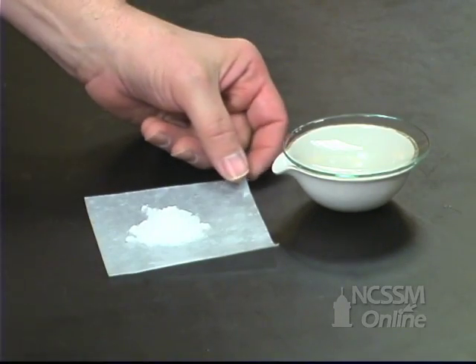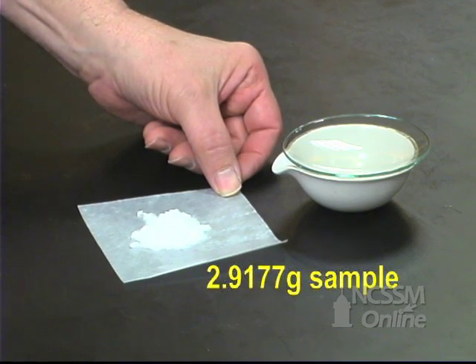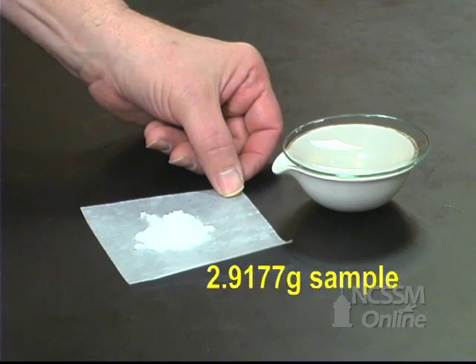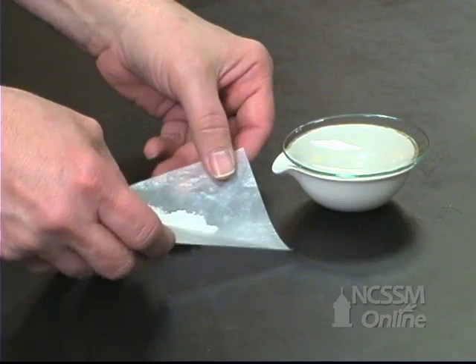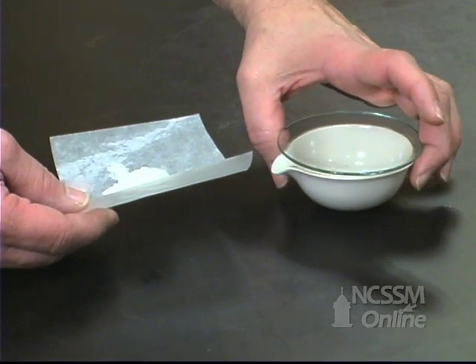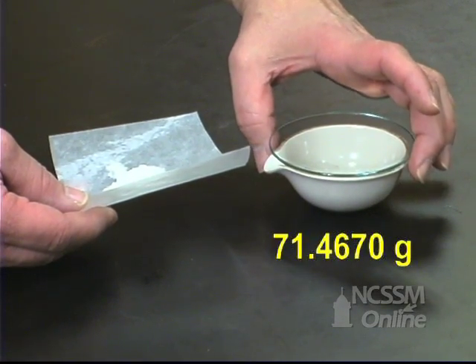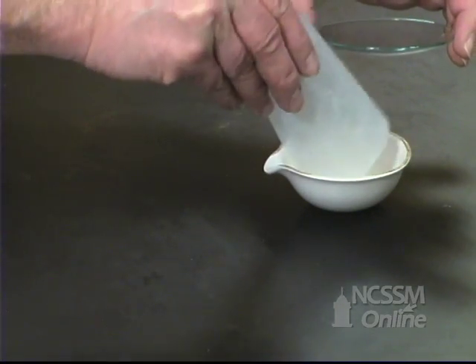We have a two-component mixture of sodium hydrogen carbonate and sodium carbonate. We've massed out about 2.5 grams of the mixture. We're going to take that mixture and add it to an evaporating dish with a watch glass. We've massed the evaporating dish and watch glass previously, and we now add the solid to the evaporating dish.